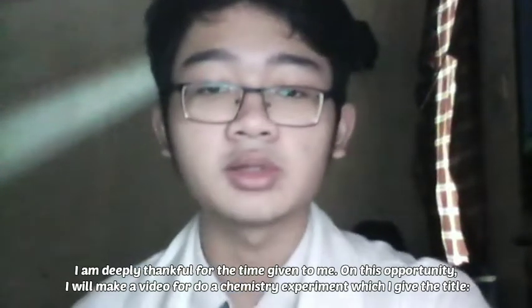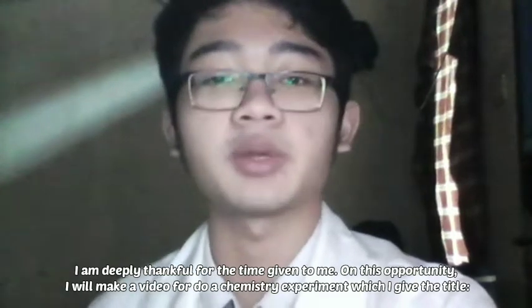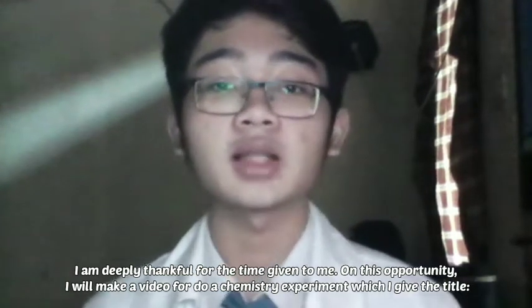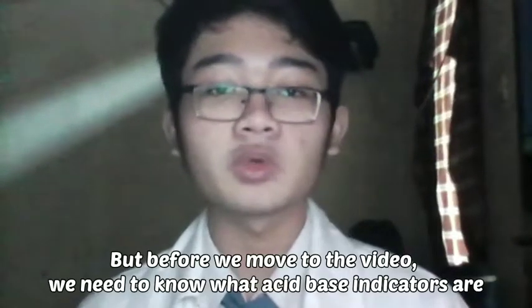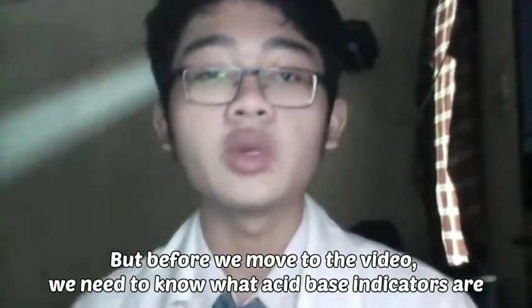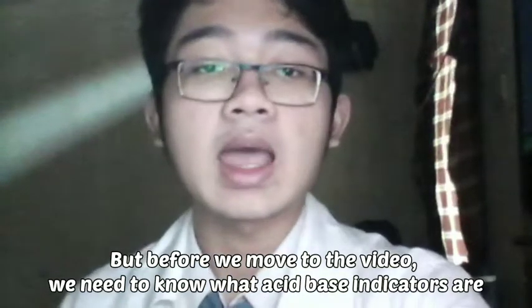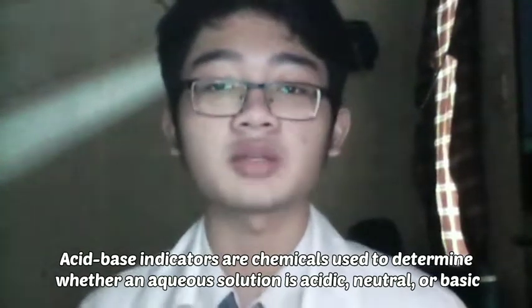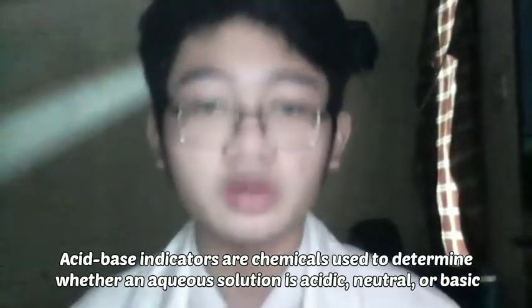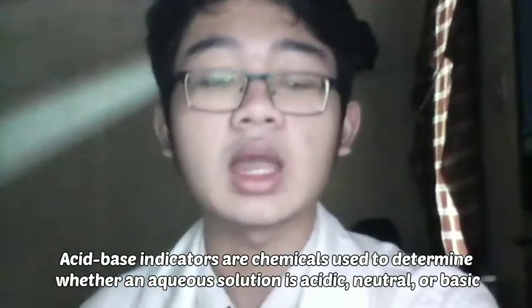On this opportunity, I will make a video to do a chemistry experiment, which I give the title Acid-Base Indicator Experiment. But before we move to the video, we need to know what acid-base indicators are. Acid-base indicators are chemicals used to determine whether an aqueous solution is acidic, neutral, or basic.